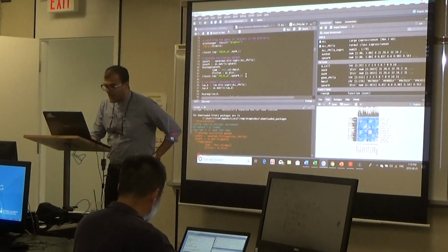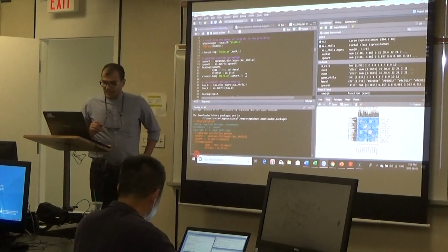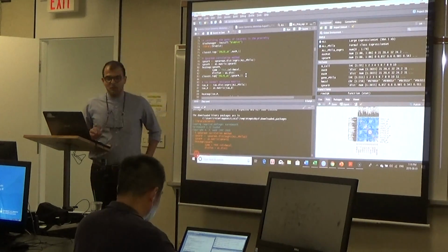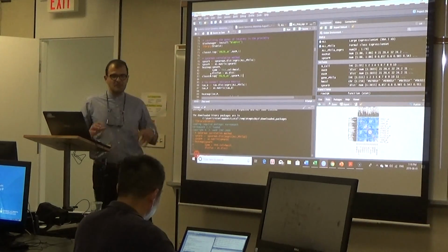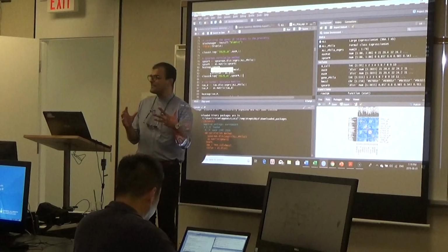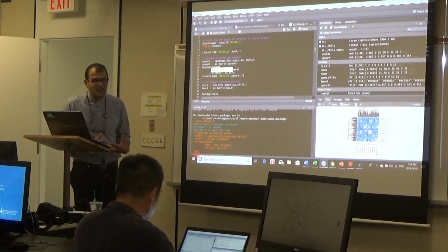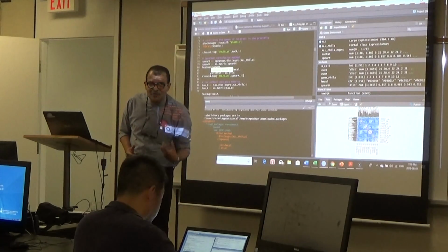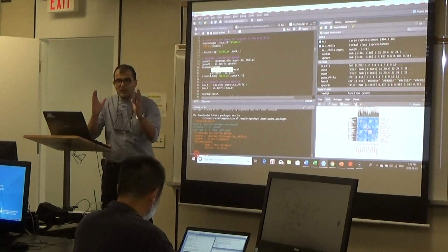And now I'm going to show you something very crucial. There is a function, look at that, which comes after the heat map functions. When you run the heat map, if you run your algorithm on the whole data set, looking at the heat map is very confusing.